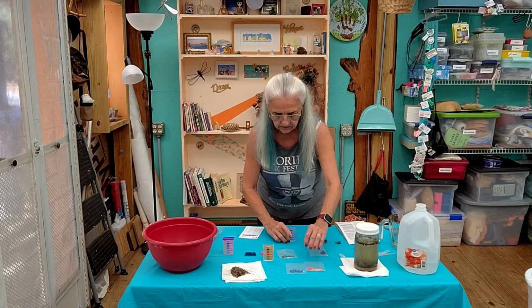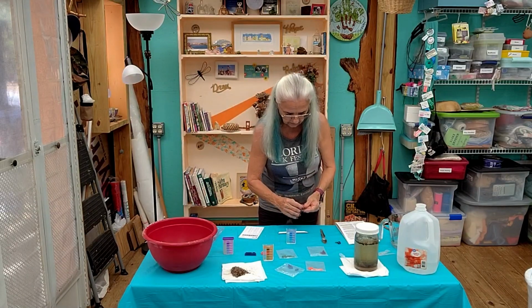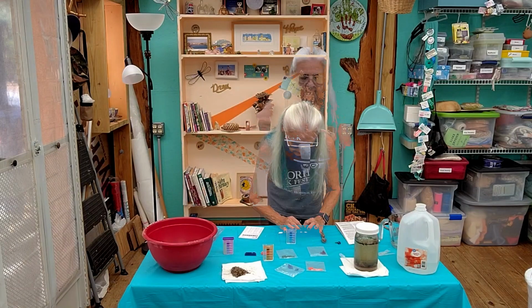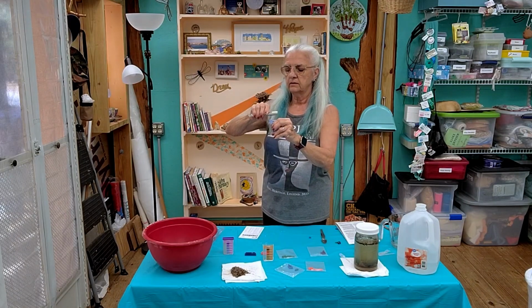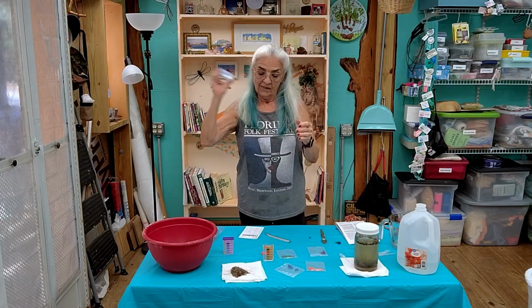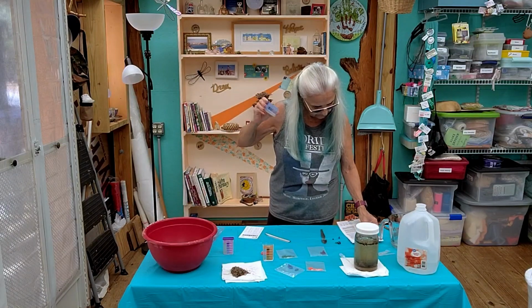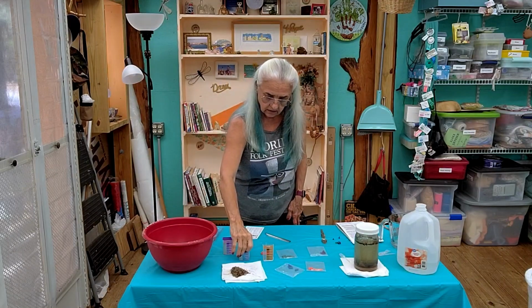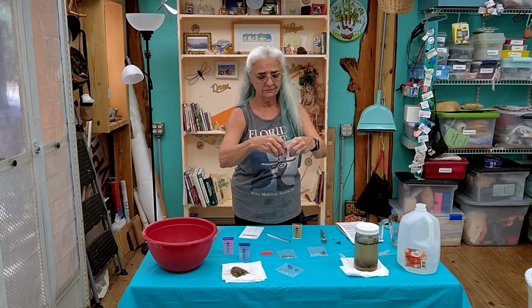Okay, the next one is the phosphorus, blue. Here we go. Blue capsule. I'm going to put it in here. I'm not going to worry about the fractions of powder that I ended up pulling off. And we're going to put the top on here. Shake, shake, shake. The difference in this is it has to settle and do what it needs to do for 10 minutes. And then this is the potash, color coding. Yay. Make it easy.